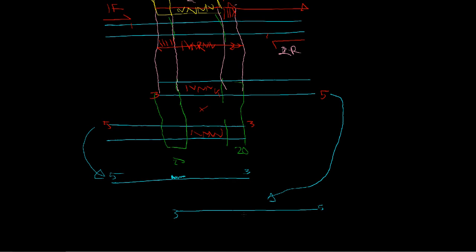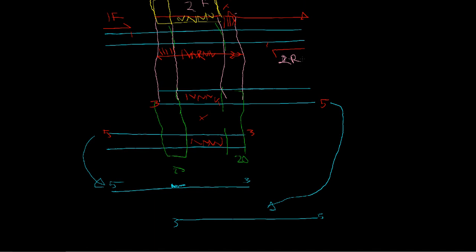And in our other fragment of DNA, let me move up a little bit, this oligo was binding at this region in order to generate these fragments. But now we're going to be using that other overlap area. So we had this other overlap that we just put there for some reason, and this is what's going to allow us to sew together our stuff.